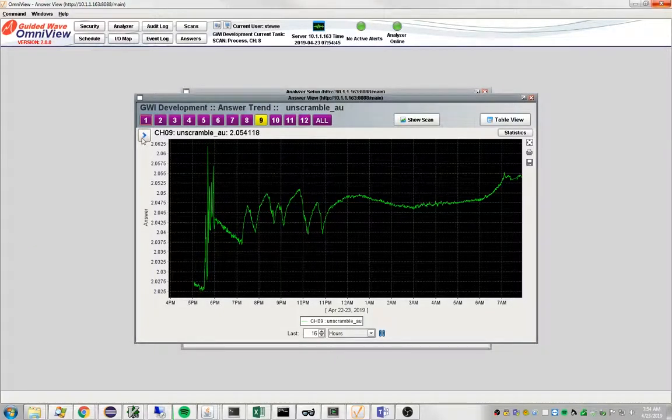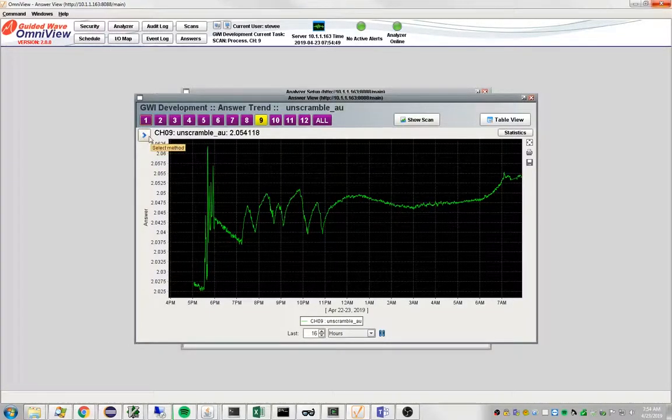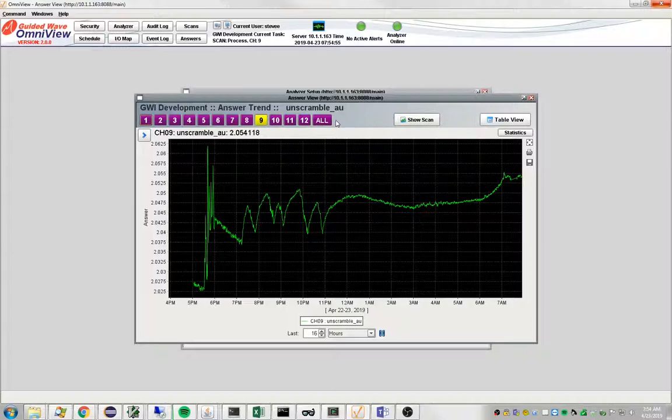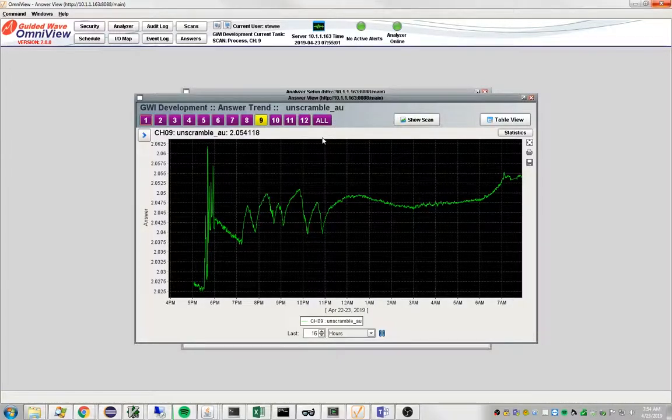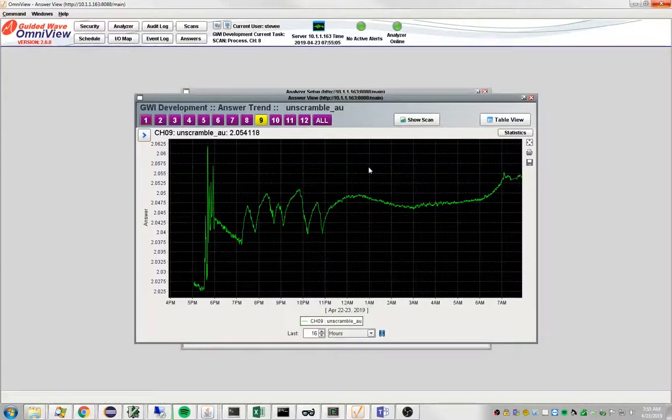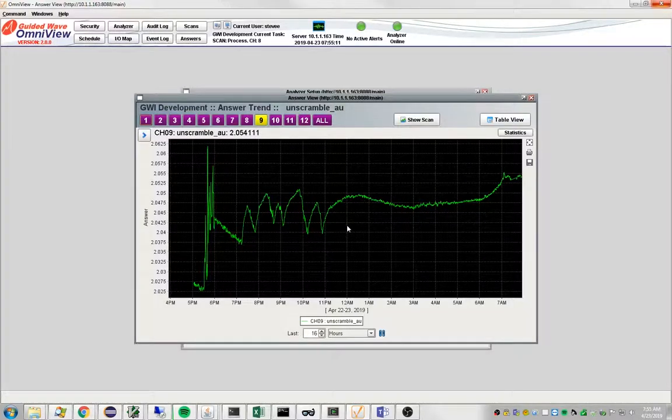Ideally what you want is Omniview to communicate these values out to the plant DCS, perhaps being watched in a control room by a process manager. How do you get these numbers, these values, out to an interested party?